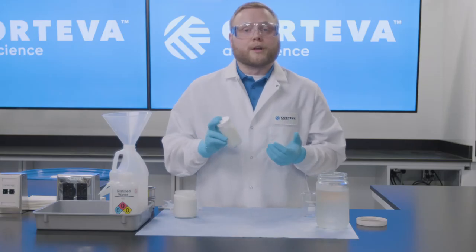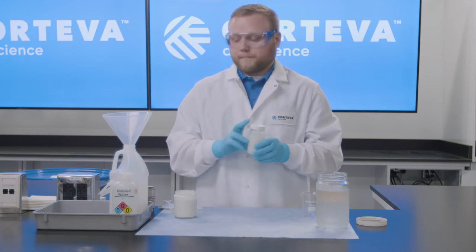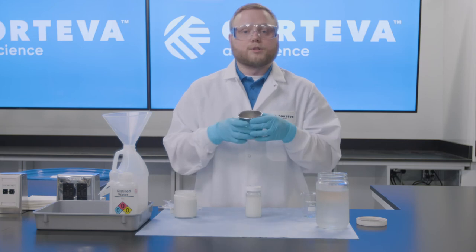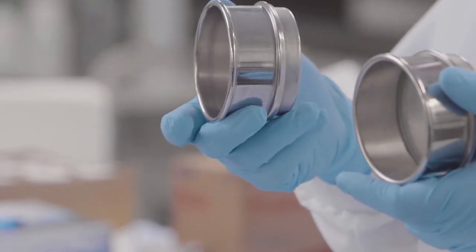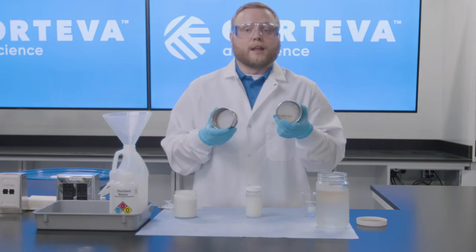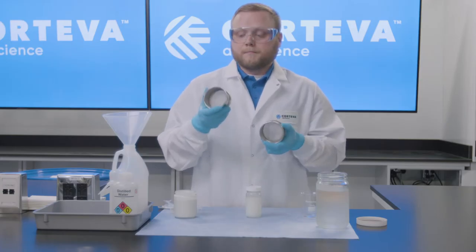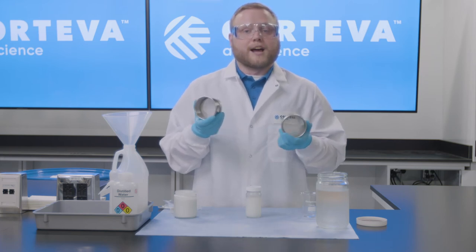Now, the most important thing when it comes to spraying fertilizer products is that we don't plug any filters or screens in the sprayer. To simulate that, we have two sieves — each representing a different mesh on a sprayer. We have a 50 mesh, which is a very common inline filter size, and a 100 mesh, which is less common.